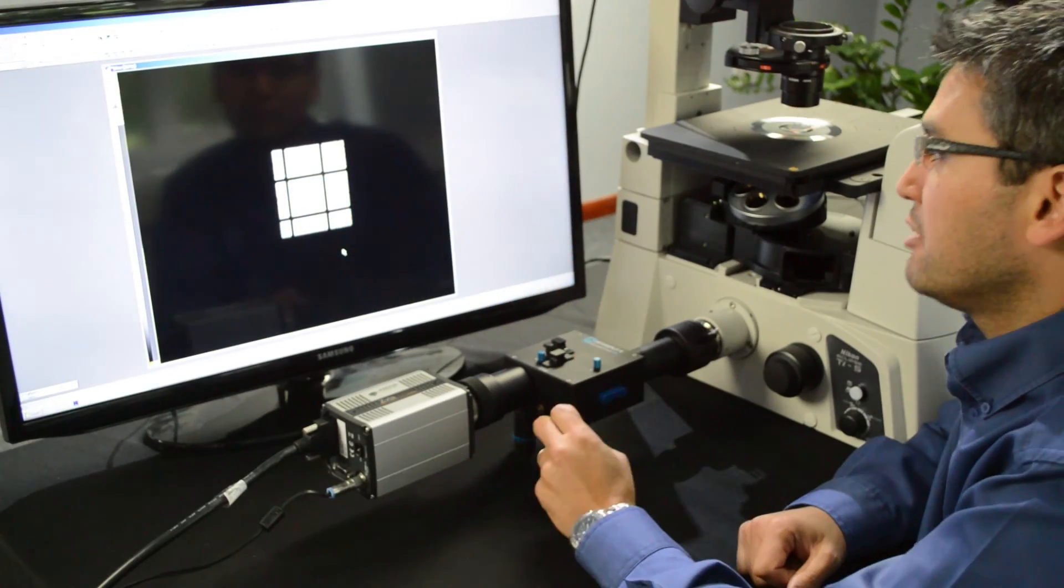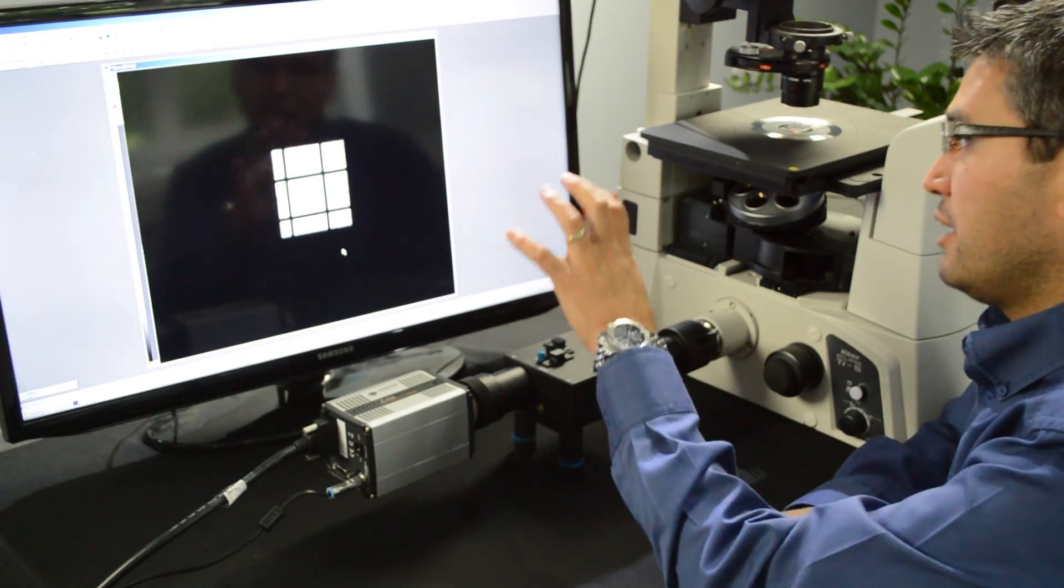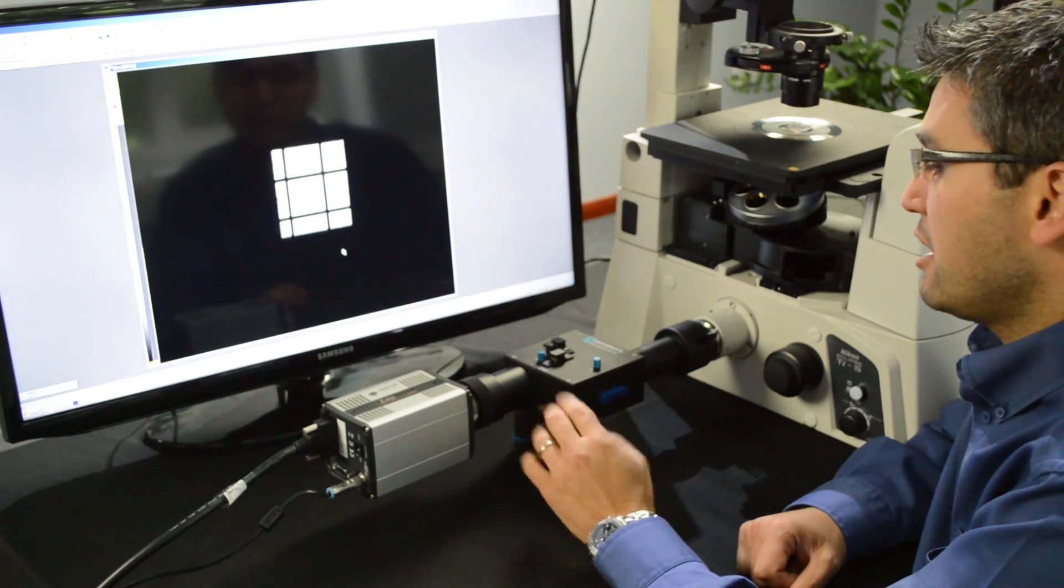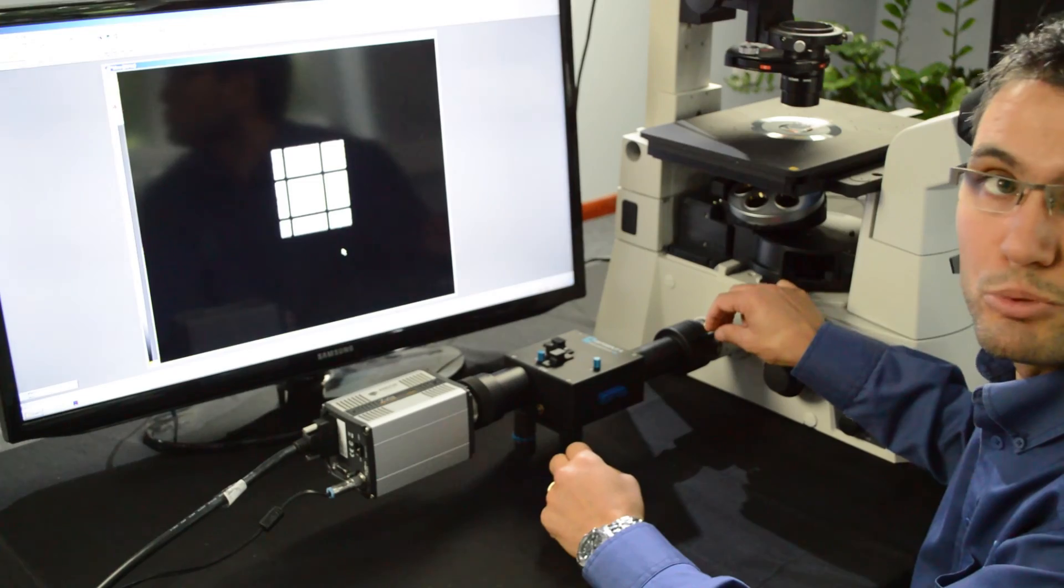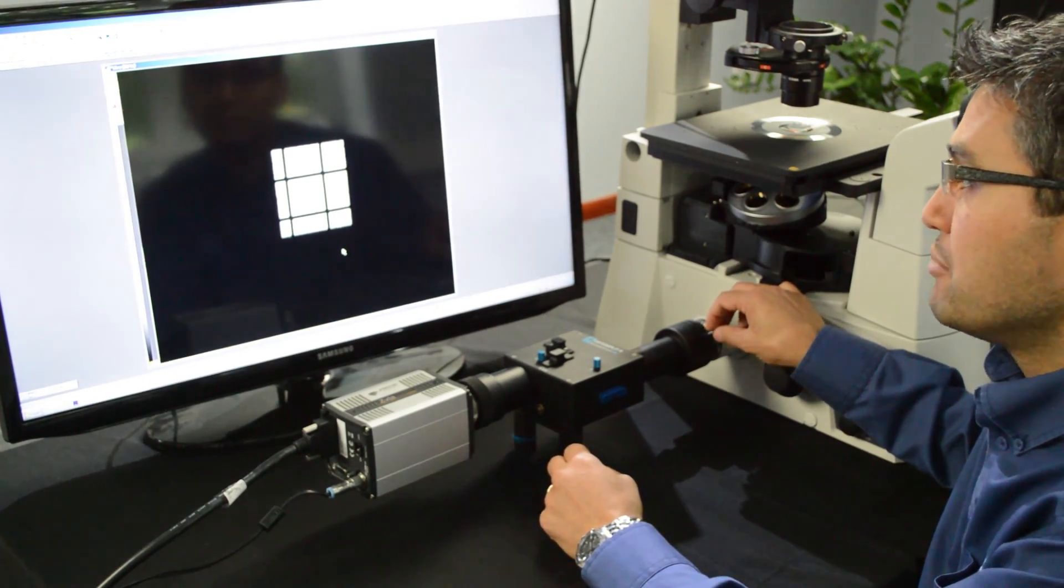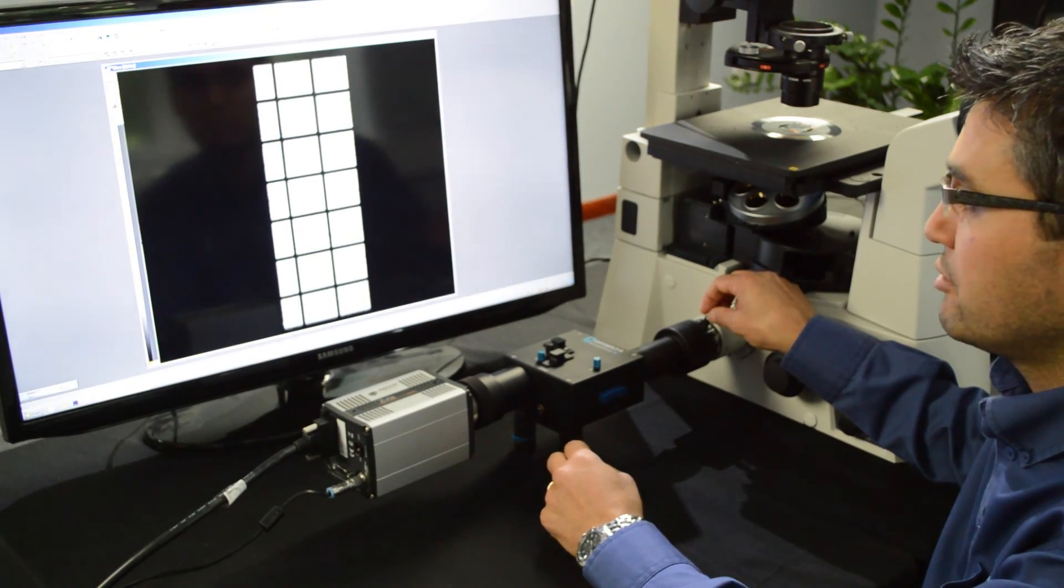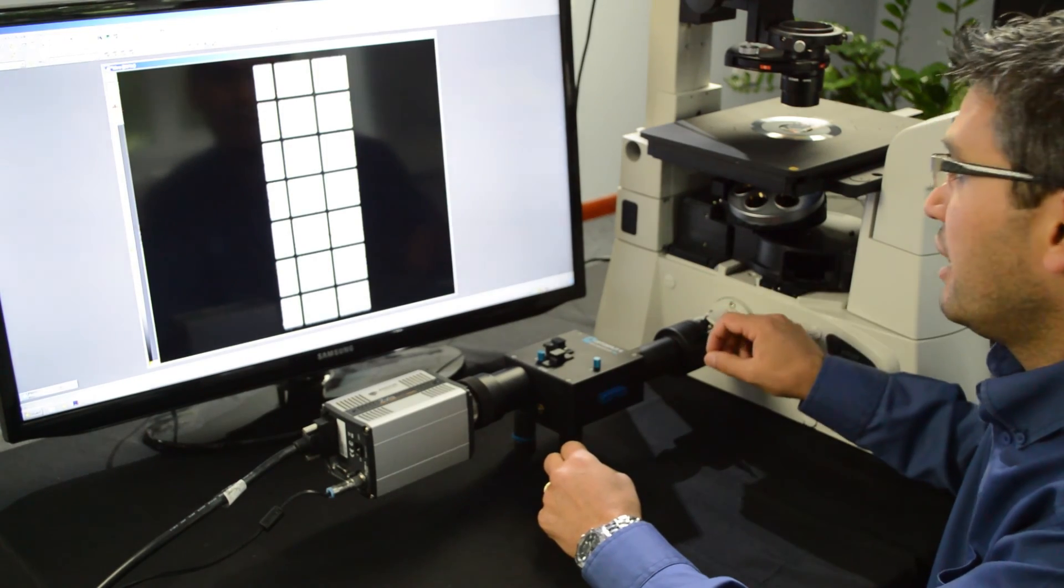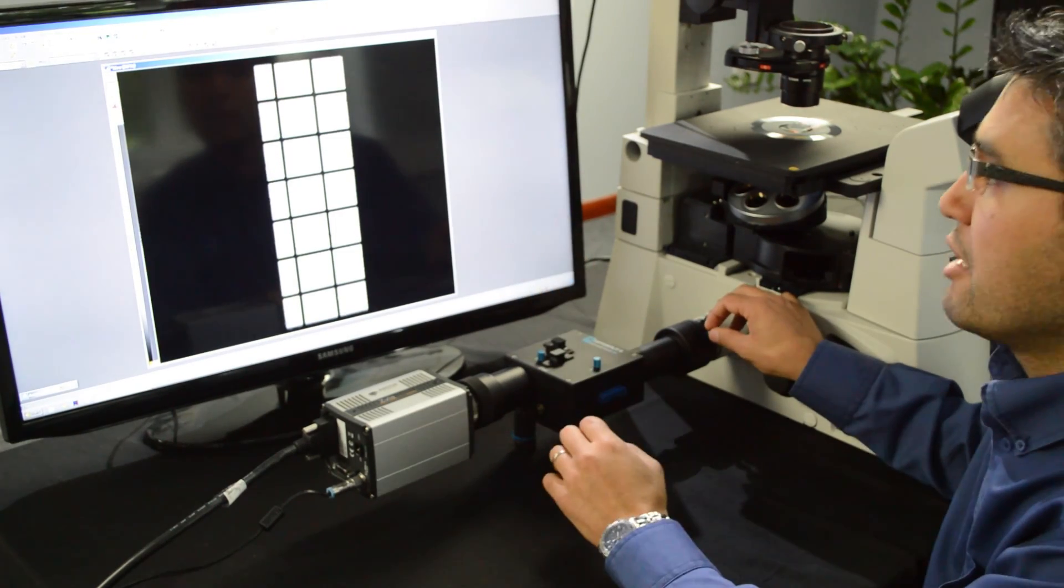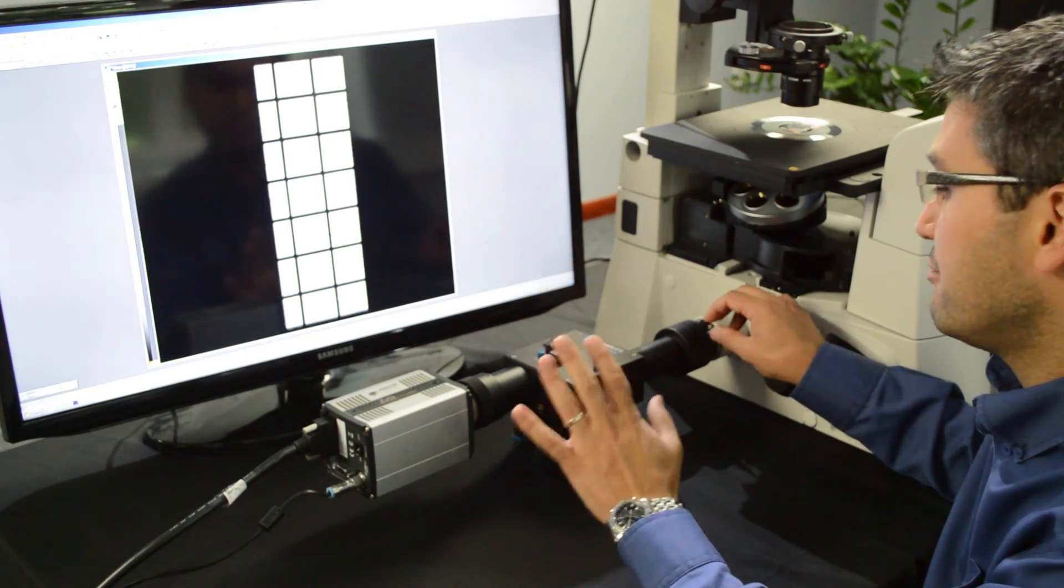To have a good overlap of both your emissions and they're centered on your image on a smaller area, use these two controllers which control the aperture, the vertical and horizontal aperture. You'd use them to first fill in your vertical section of your chip, and then once you have something that is about a third of the size of your horizontal area filmed by the image.